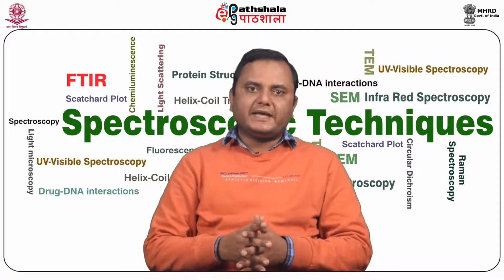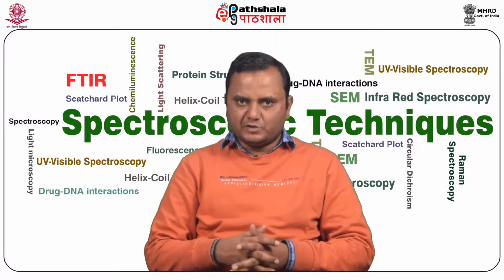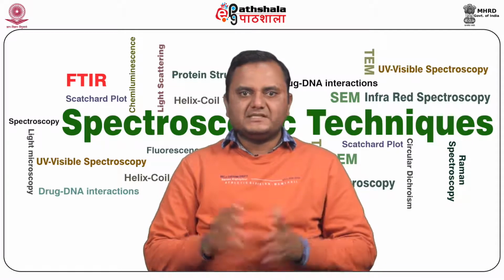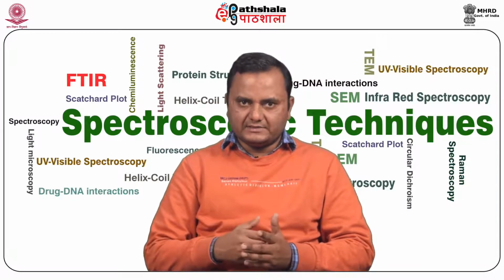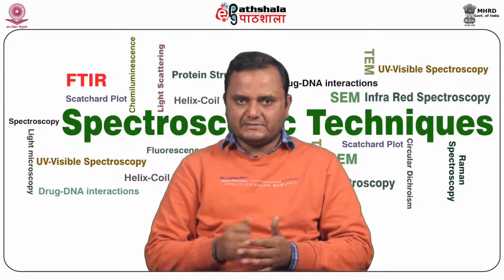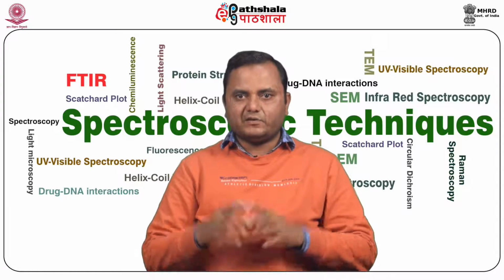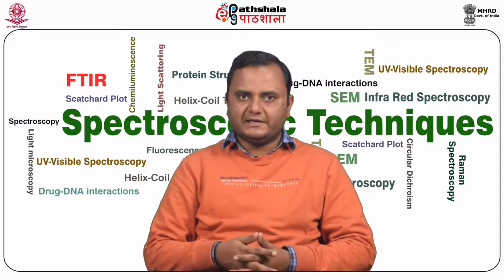Generally, all optically active compounds exhibit CD in the region of an appropriate absorption band. So an optically inactive molecule does not show any CD. CD is measured as a quantity called mean residual ellipticity, represented in the unit degree centimeter square per decimole. The absence of regular structure results in zero CD intensity, while an ordered structure results in a spectrum which can contain both positive and negative signals.